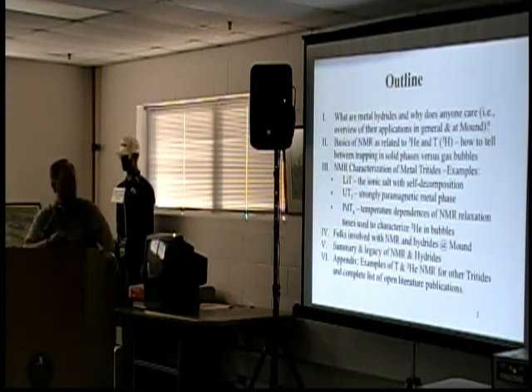Most of you probably are aware that NMR is what magnetic resonance imaging is, and I suspect from the age of folks here, you've all been in an MRI at one time or another to have something examined. I've had my turn in there, and I decided I'd much rather do the experiment than be in the experiment. The way we did NMR here at Mound is very different than resonance imaging, but the basic physics is the same. NMR were done on a number of tritides.